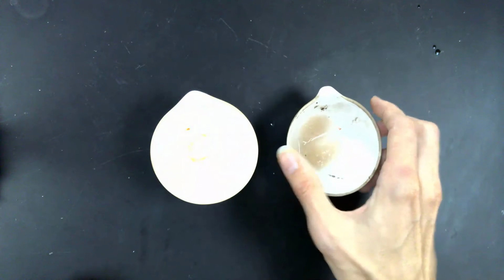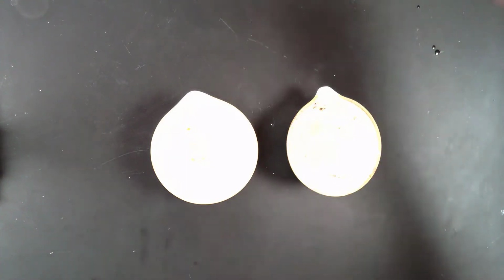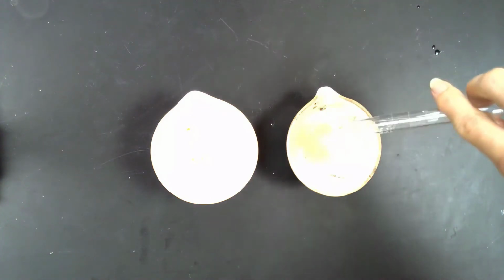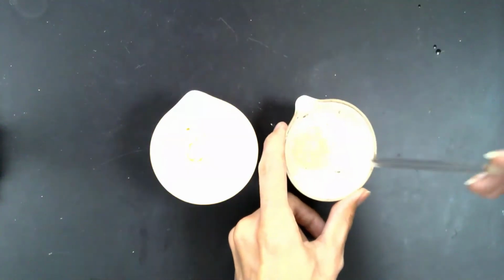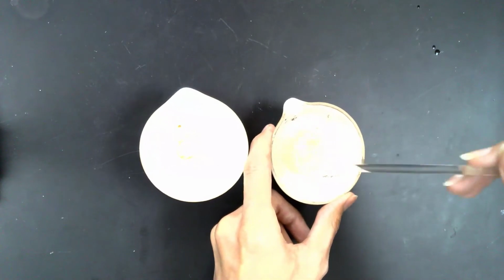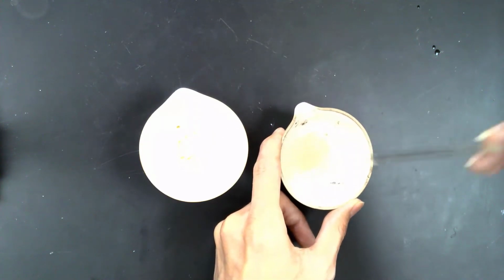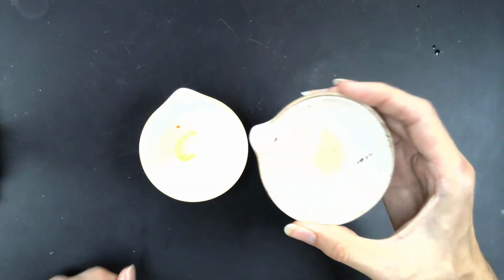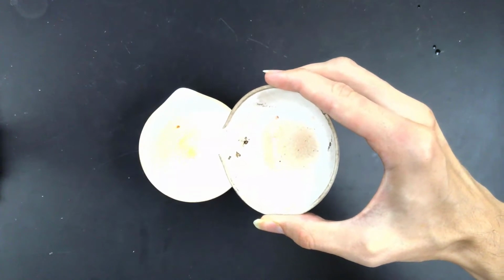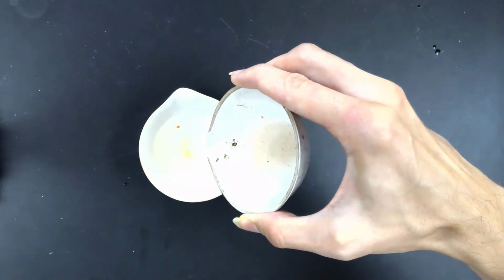Okay, so I'm going to add my second 8 milliliter aliquot. Same thing, I'm going to stir. And decant. Again, I don't want to tilt it too far and end up with sand in my salt water.